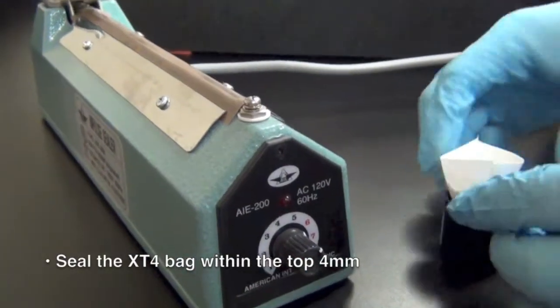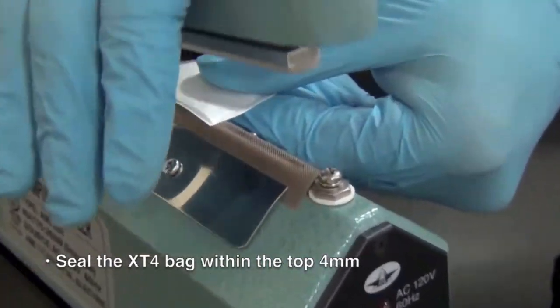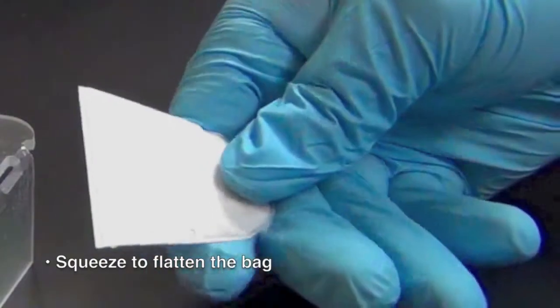Seal the XT4 filter bag within 4 millimeters of the top of the bag. Lightly squeeze the bag to flatten it.